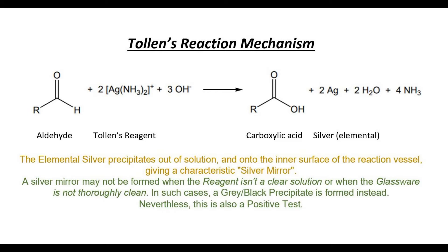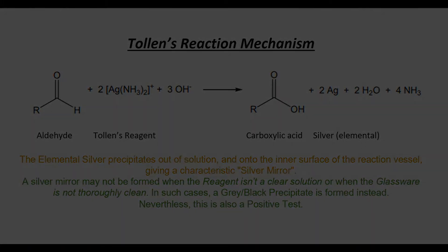The carboxylic acid is not directly formed, as the reaction takes place under alkaline conditions. A silver mirror may not form in some cases, especially when the reagent is not a clear solution or when the glassware is not thoroughly clean. In such cases, a grey to black precipitate is formed instead. Nevertheless, this is also considered a positive test.